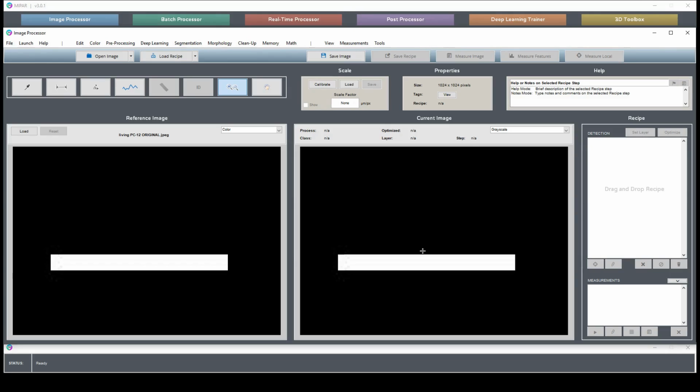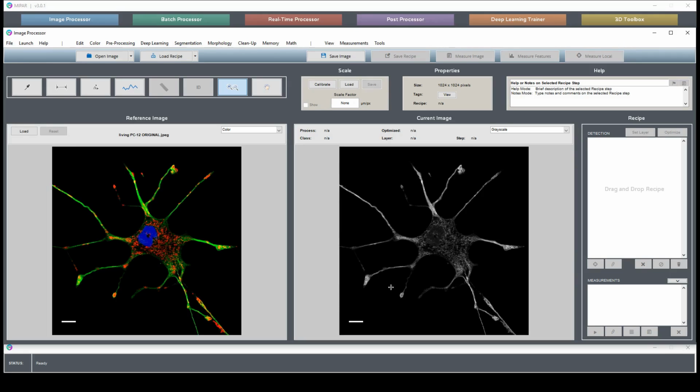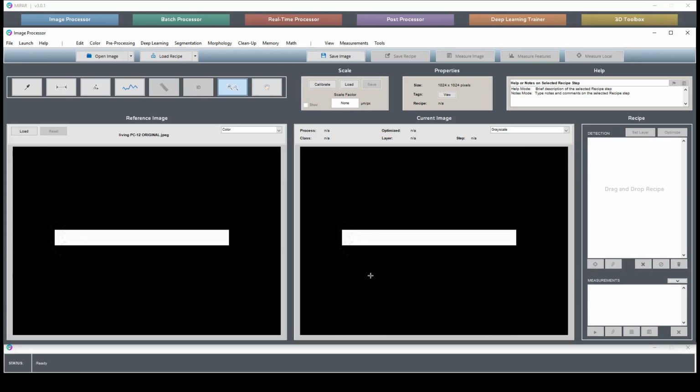Which one you want to do depends on the type of processing that you'll be doing later. Is it important to have the actual grayscale values removed or not? We'll start with the simplest method at first, just getting a segmentation of the scale bar and then subtracting that. And if it turns out having these white pixels here in the image is an issue, we'll fix that later.